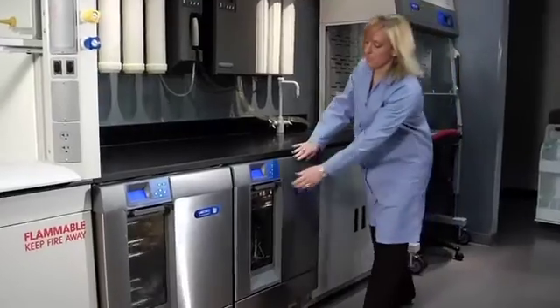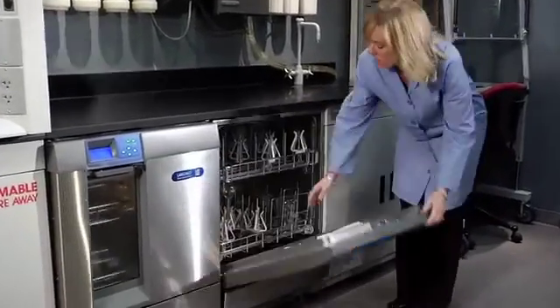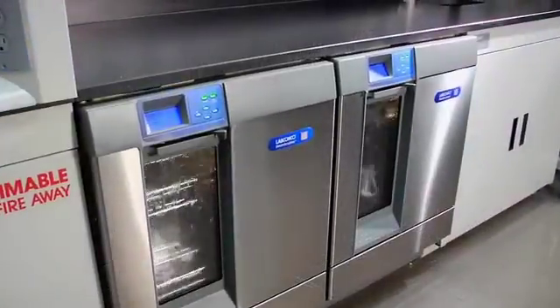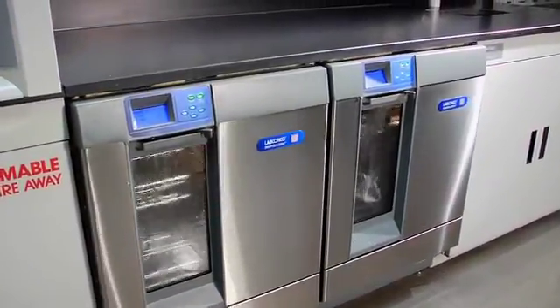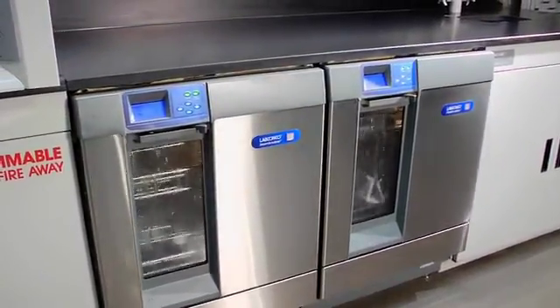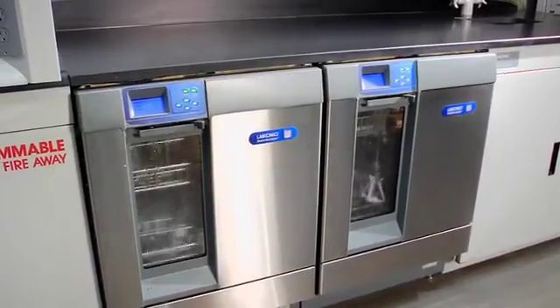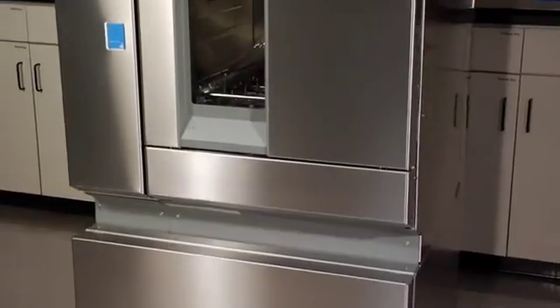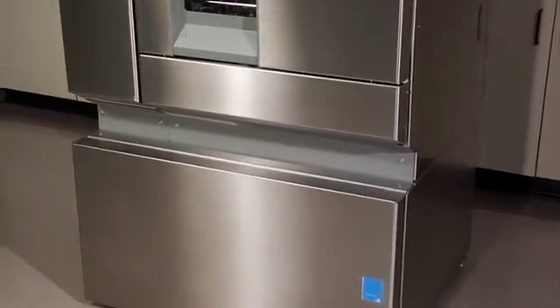LabConco glassware washers provide a safe, economical, and time-saving alternative to hand washing. By doing just two loads a day, you'll see the payback period in just two years. LabConco offers three distinct automatic glassware washers, each designed specifically for laboratory use.